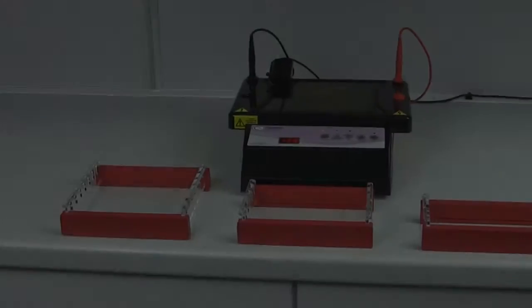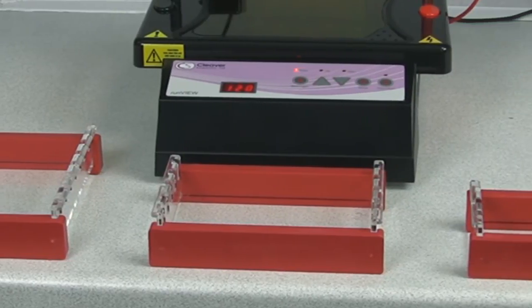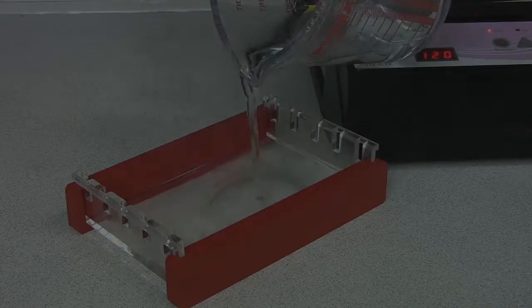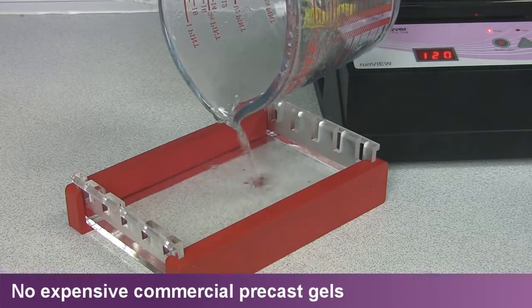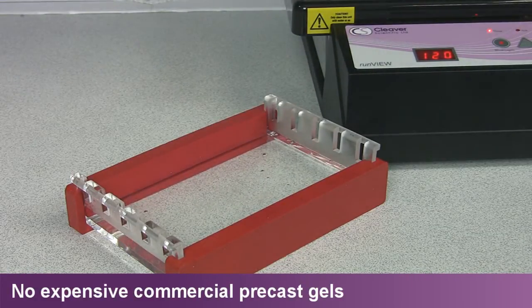RunView works with standard reagents including ethidium bromide and cyber-stained agarose gels cast within MS Choice trays. However, best results are achieved with RunSafe, Cleaver Scientific's proprietary non-mutagenic stain that is mixed with DNA for immediate detection under blue light.